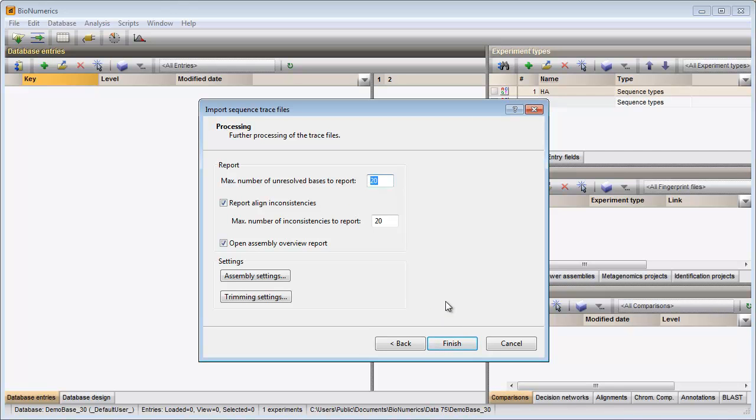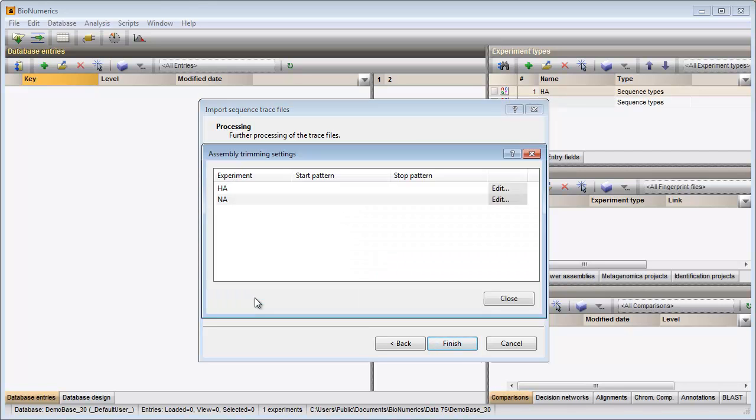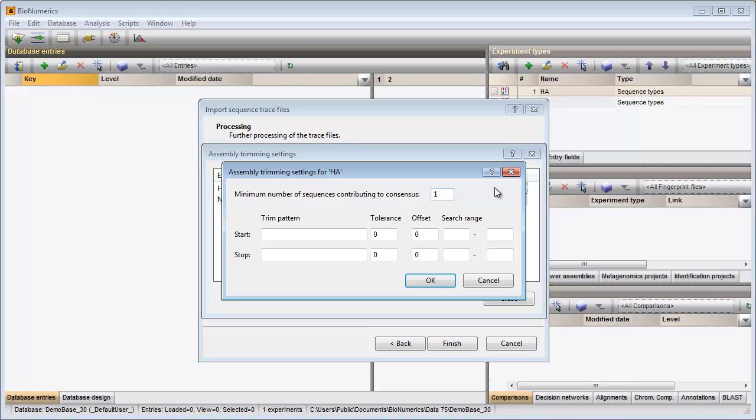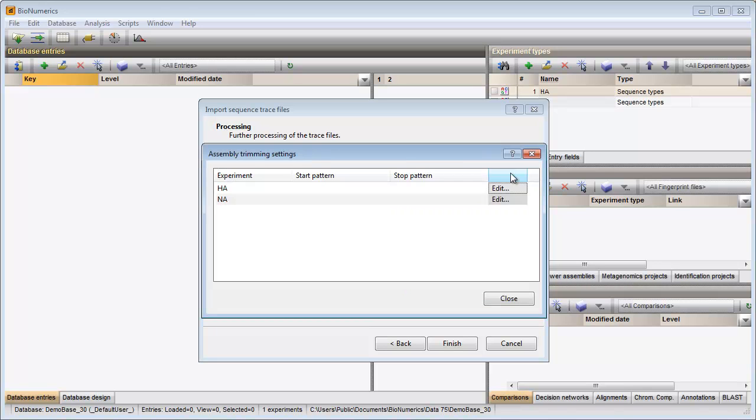In the final step I can specify some additional settings for the preprocessing of my trace files. Pressing the trim settings button allows me to define start and stop patterns for each experiment. For this exercise I will not add any patterns and I can close the windows.